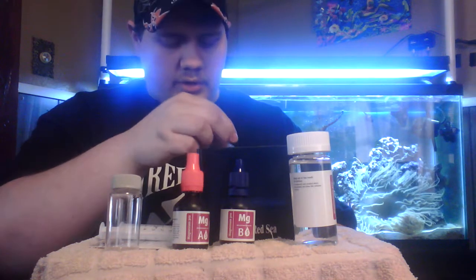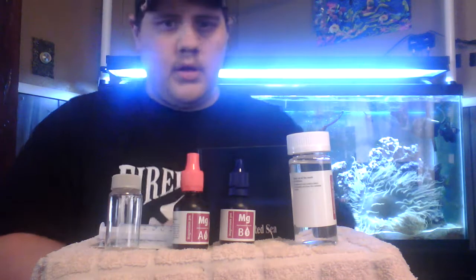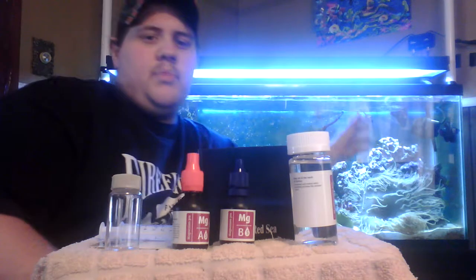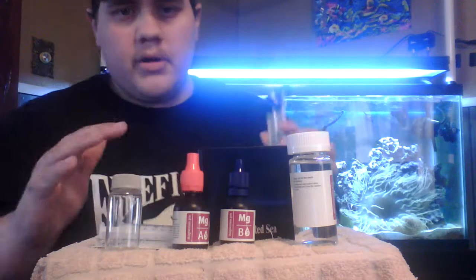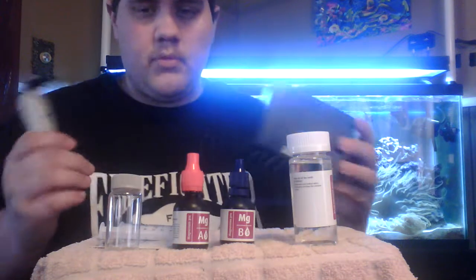We're actually going to go through and test the magnesium in the 55-gallon tank here. You can see my nice big long tentacle anemone over here — this is my baby — and one of those little maroon clownfish right there. So we're going to run through and do this test real quick and we'll see how it works.